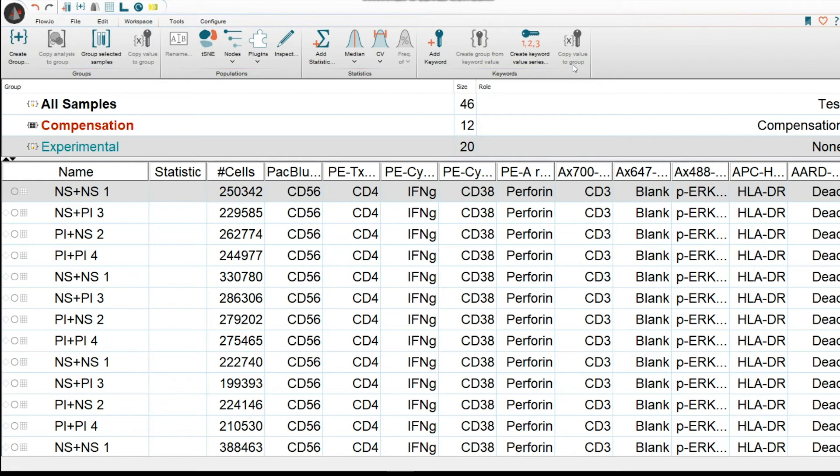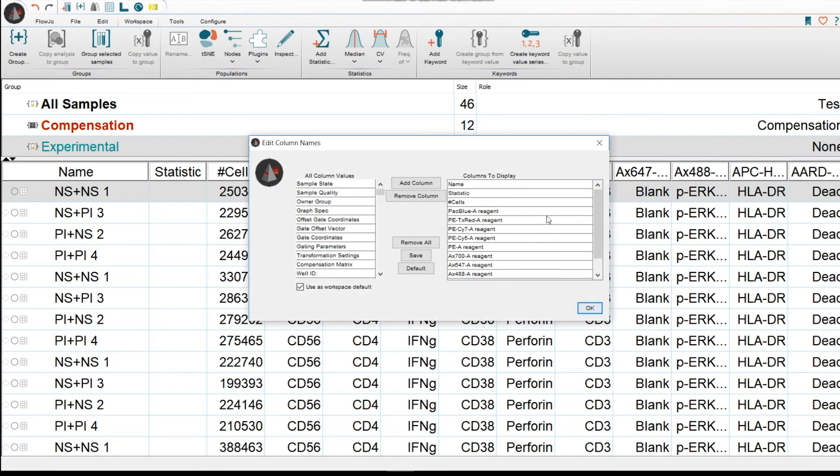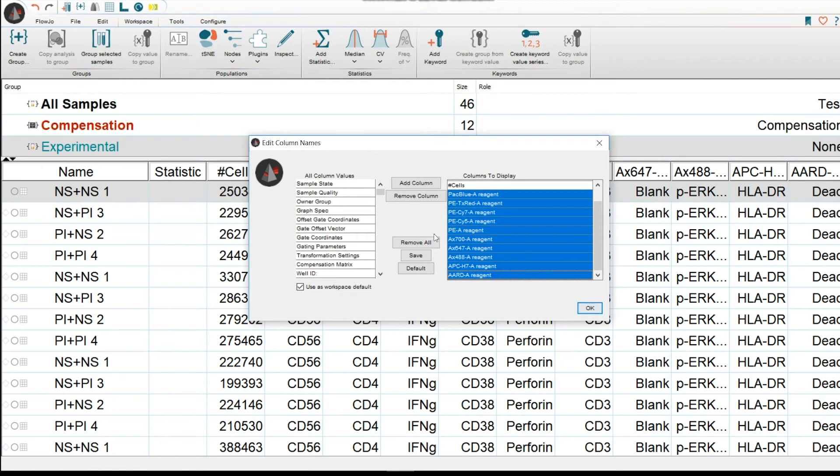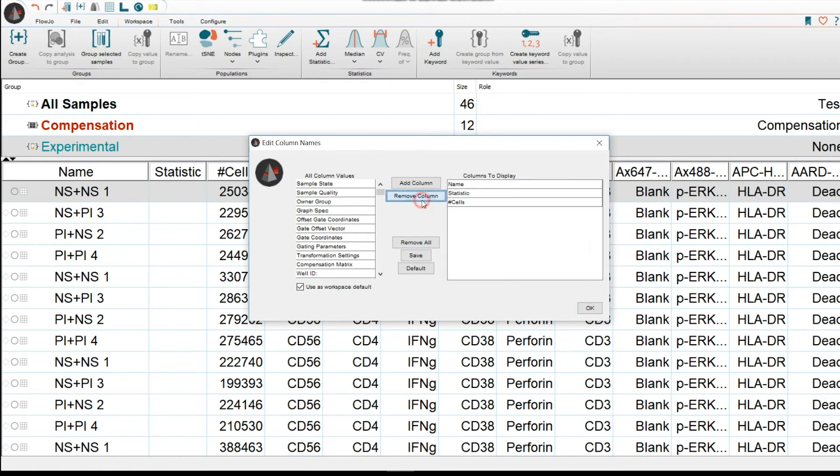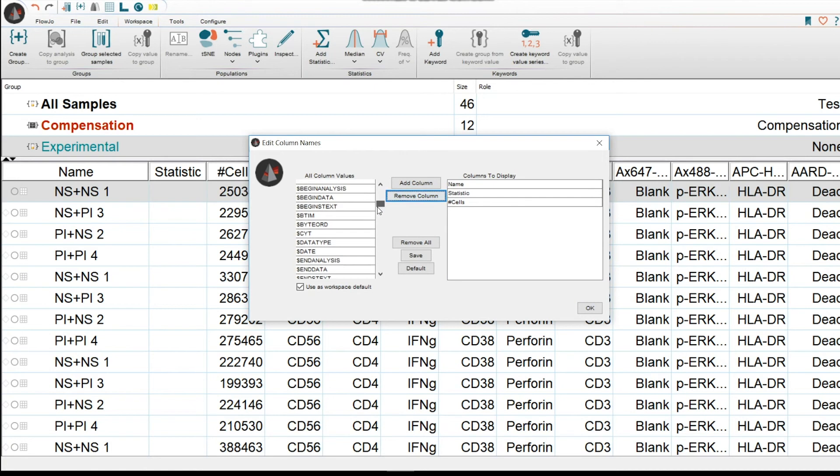What about if you wanted to see an actual keyword that you've already used? Let's get rid of these parameters and view the other keywords that were entered during time of acquisition. Right-click, Edit Columns. We're going to highlight the different reagents, remove them from the columns. Then we're going to scan the keywords.